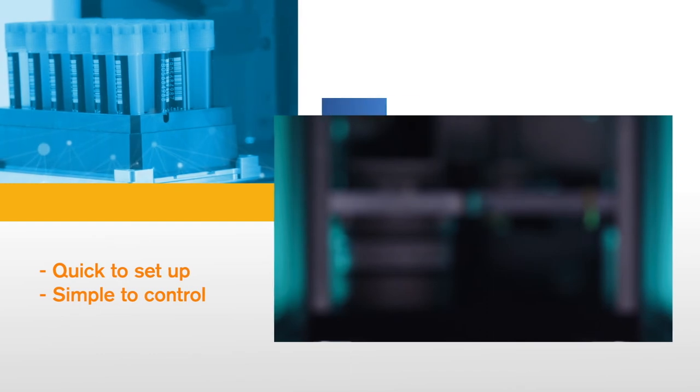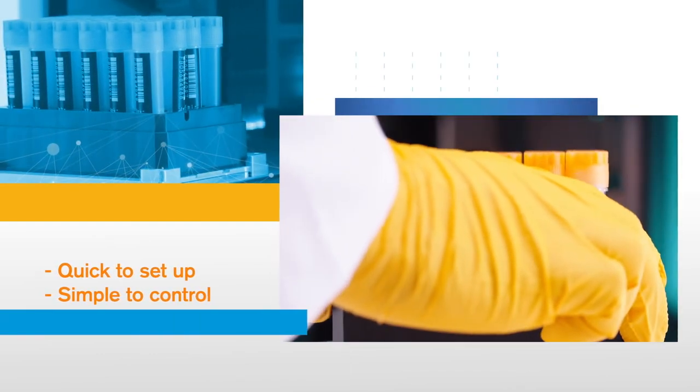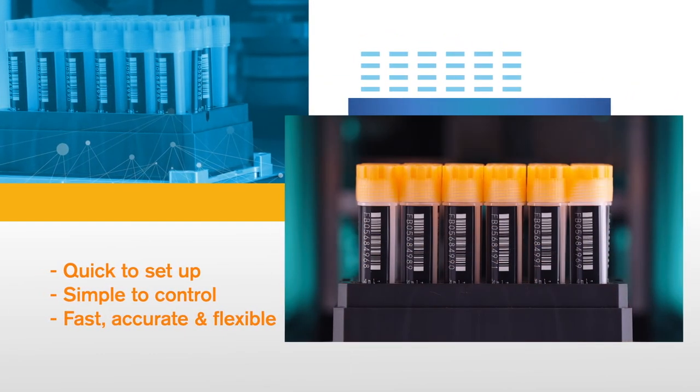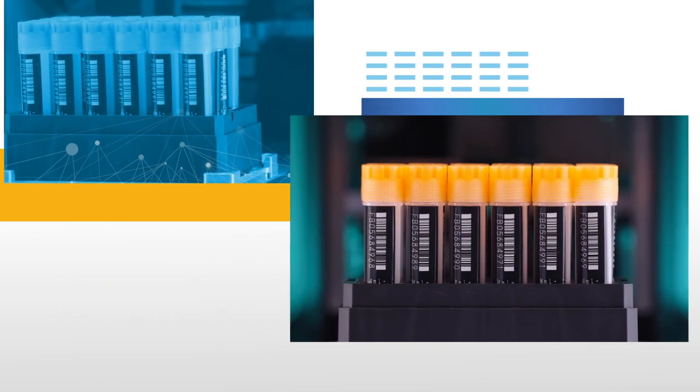Quick to set up and simple to control, the Intelli XCAP24 delivers fast, accurate and flexible automation. The result?